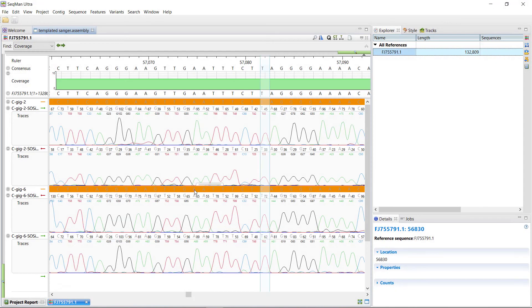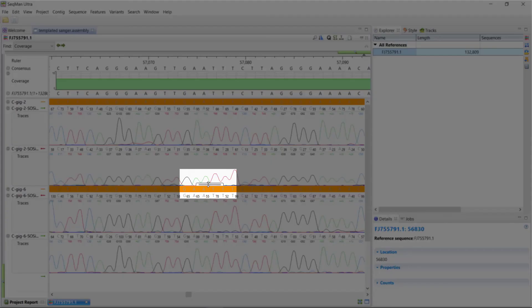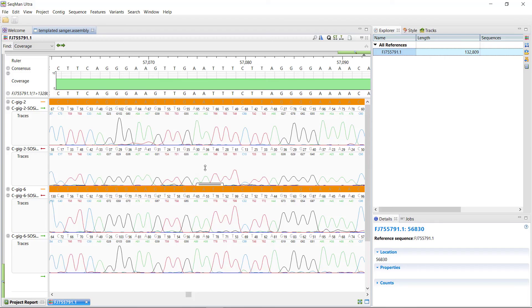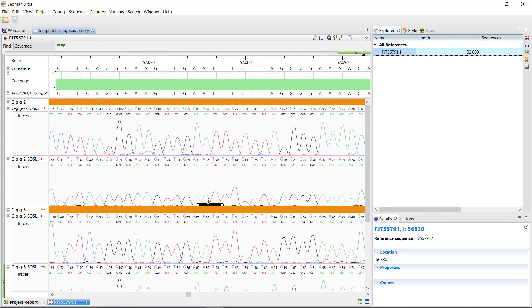To expand or contract peaks, simply drag this bar up and down.